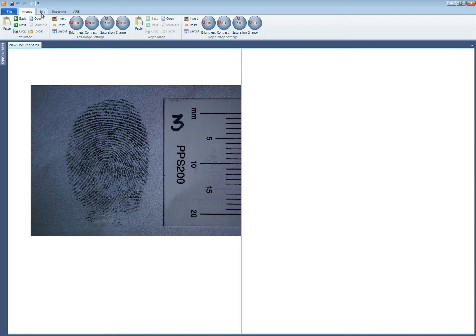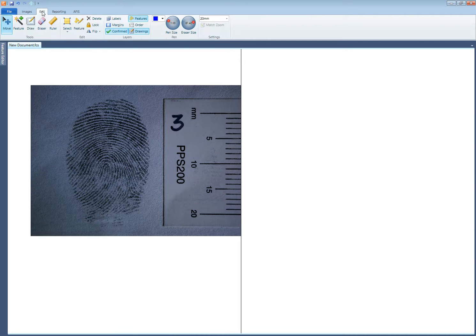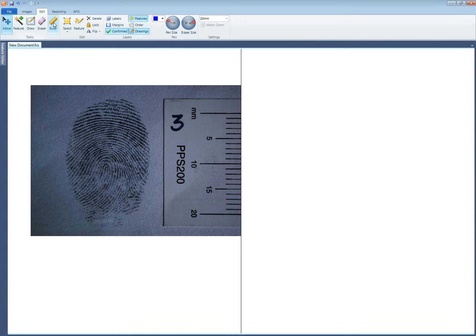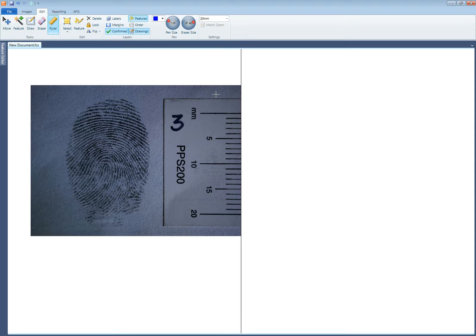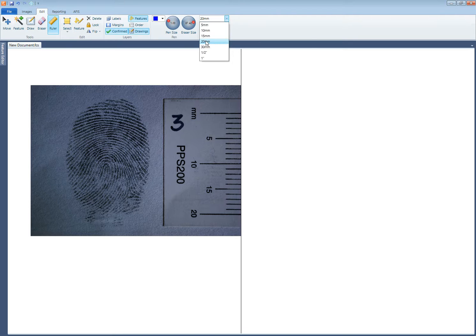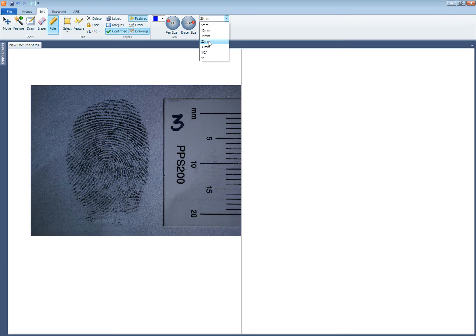So I'm going to now go to the next step which is to tell my software how big this latent is. And I'll use the ruler tool in the edit tab to do that. And I also need to make sure that the scale is set to a certain distance and I know the scales that I included in my shot are 20mm so I select 20mm.